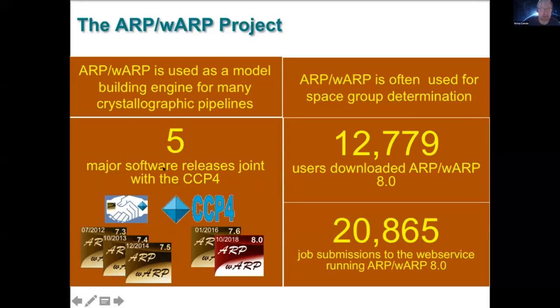I'm very pleased that we had extremely fruitful cooperation with the CCP4 for a decade, and we had 5 joint major software releases. Here they're shown with the latest release 8.0. Its updated version was made available in early 2019. And over the 3 years, it was popular. More than 10,000 people downloaded it, and they used it at home.